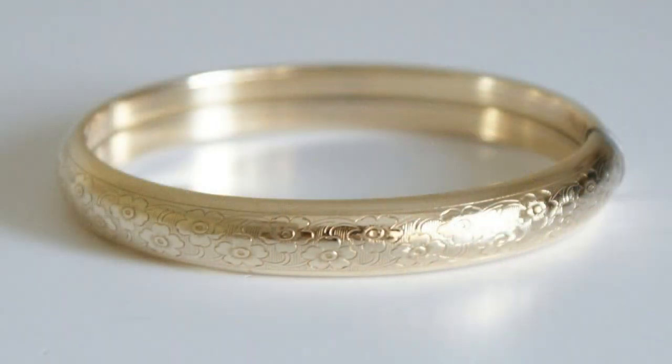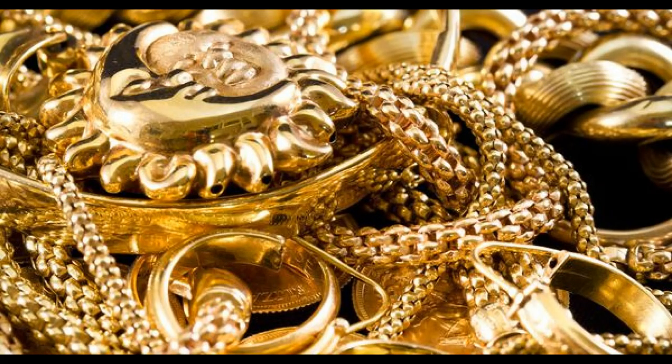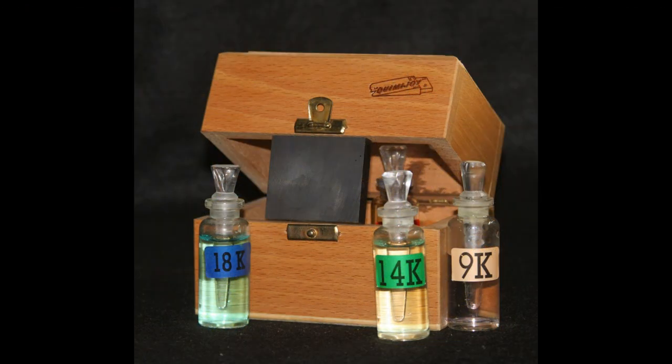Because some vintage and custom jewelry pieces may not have any hallmarks, you need to also possess the ability to identify a quality made piece of jewelry by understanding the techniques and materials used that give you a strong indicator that a piece is genuine. What I want to talk about here is specifically the touchstone testing method of determining the authenticity and purity of precious metals — specifically gold and silver.